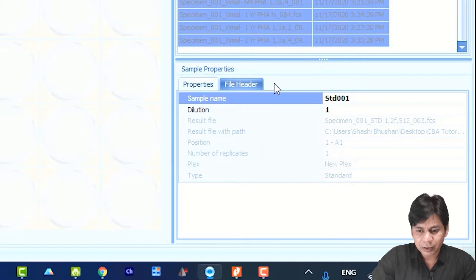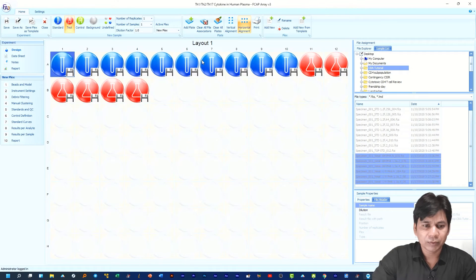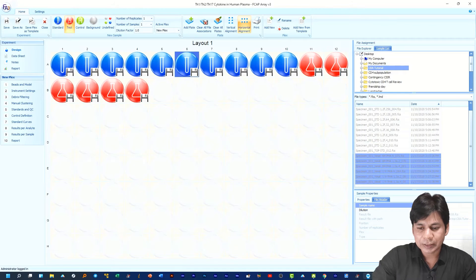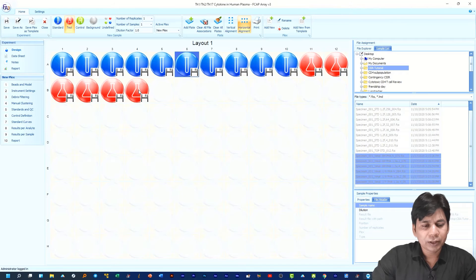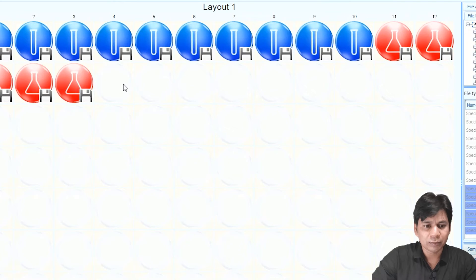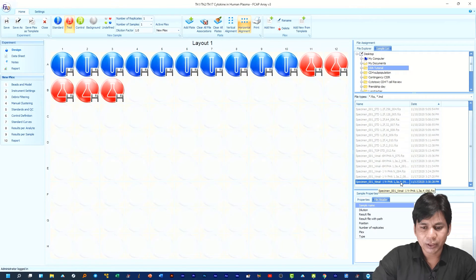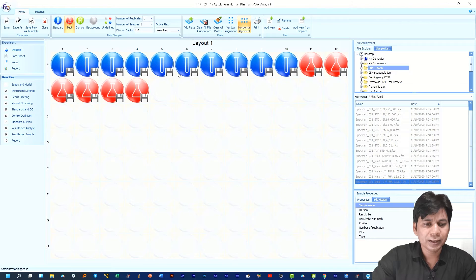In each well you can see the standard name with the dilution — for example, Standard 1 with dilution 512. If you want to check the sample name from the layout, just click on it and you can see the information in the Sample Properties panel. If you want to delete any sample, just click on it, right-click, and select 'Remove Sample.' If you want to revert, select the file and drag it back. You can easily remove or add samples and standards in the layout.